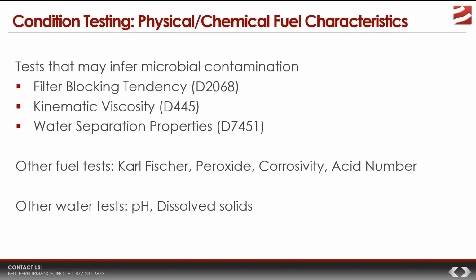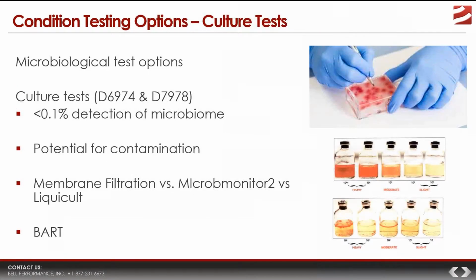So the last category of tests that we would undertake are the ones that are most applicable, most specific to measuring or detecting microbial contamination itself. And those are, of course, the microbiological tests. So let's talk about those, because there's plenty to talk about.